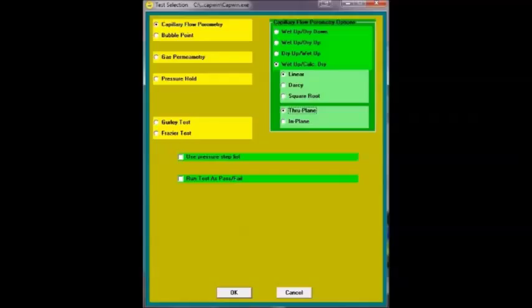Capillary flow porometers offer a wide variety of testing options. They also double as a permeameter, able to do gas permeametry, which would be permeability testing on samples, getting flow rates on dry or wet samples, and then plotting them against pressure. The standard machine can also do pressure hold, burst, Hagen-Poiseuille, Frazier and Gurley permeability options as well.